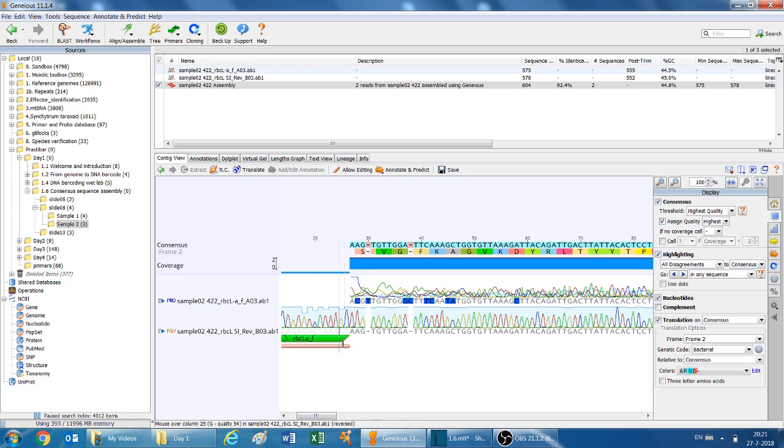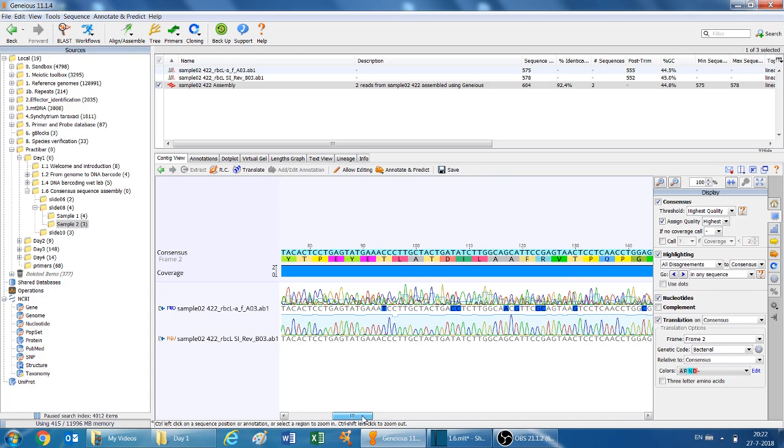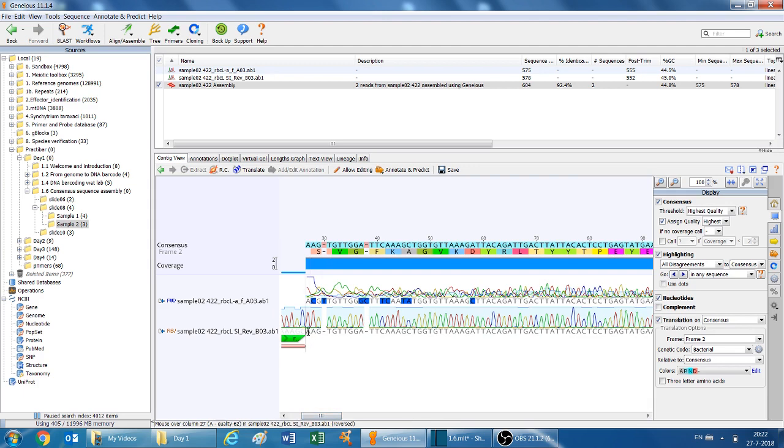So we'll just start with looking at the sequences here. Really, this sequence data is messy, and it doesn't help us a lot in terms of supporting the sequence data that we have in this read. Since the sequence data in this read is really nice, we can use only this single sequence to determine the consensus sequence, because this C and this T and the G and C and T and C over there, that's just messy data that wasn't called correctly, so you cannot use it.